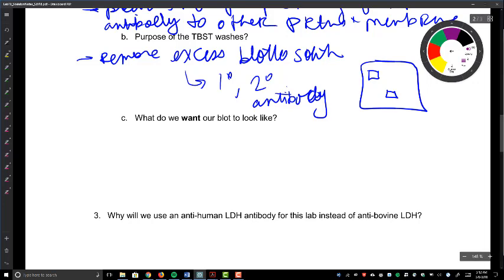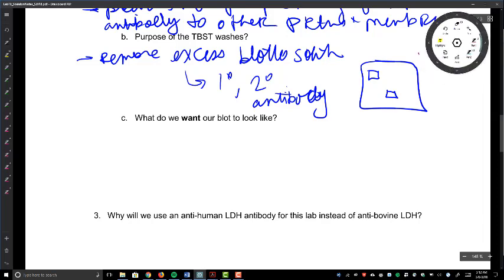Okay, so a quick thing to run over before we talk in more detail about this is a reminder that when we did gel filtration, you literally took LDH and ran it through the column. You didn't do anything to the structure, so the LDH quaternary structure was intact. And so most of you got a molecular weight of around 150 kilodaltons.